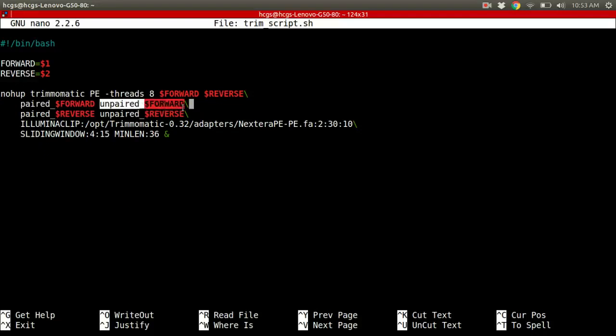So this is just a lazy way, I guess, of creating the names of these on the fly without having to type it all out again. And that's something kind of cool you can do, is you can concatenate to your variable. So this is a variable again, but it will know that if you give it something right next to it, it can concatenate it as one single argument. So I guess keep this in mind. This could be a useful trick for other things. But that's all we're doing right here, just creating some new names with some old names.